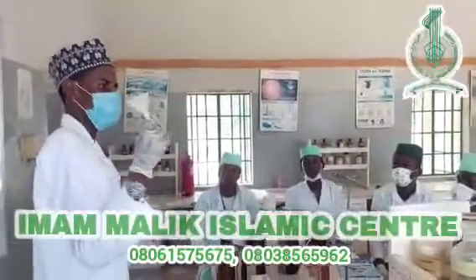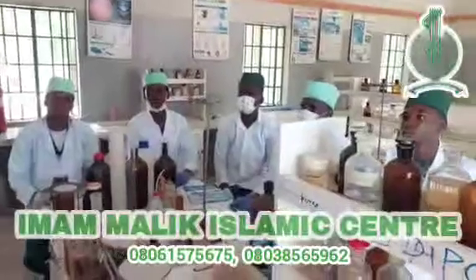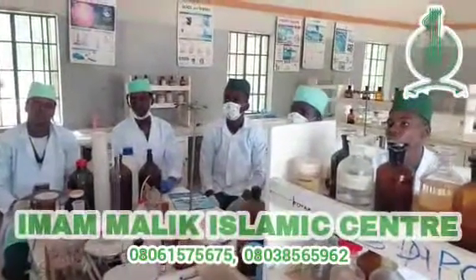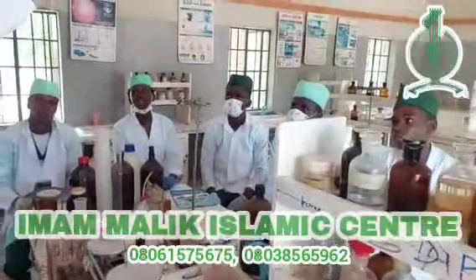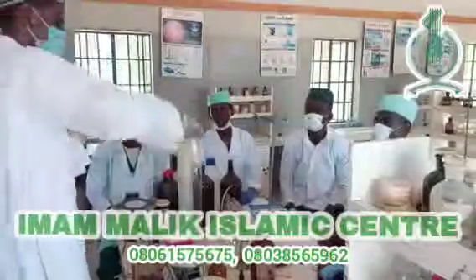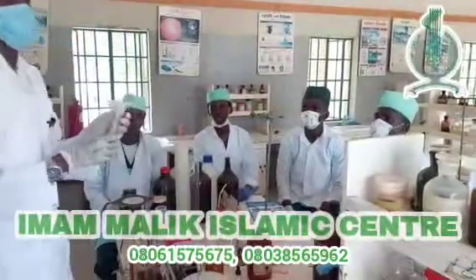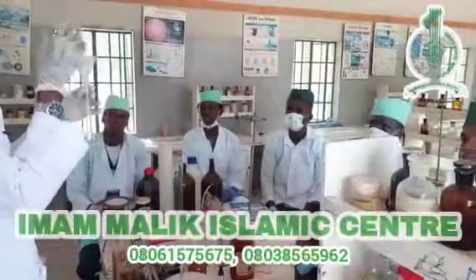What is the use of a funnel in all this? It is used to transfer liquids. Like this one is a test tube. You cannot use a beaker straight like this to transfer into the test tube. So you need something like this. It will give you the exact amount.